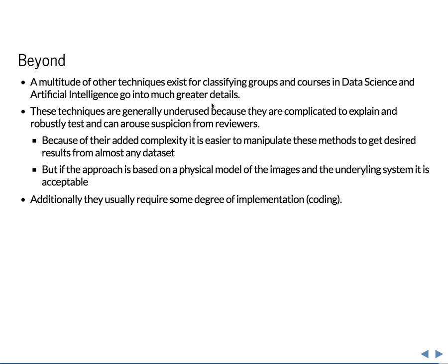But there are obviously many cases, like those of you who tried the homework last week, where you had this nerve segmentation task, and trying to apply a threshold or a filter and then a threshold gives you a very poor result. And so applying neural networks can wildly improve the results that you get if you've applied them in the right way.